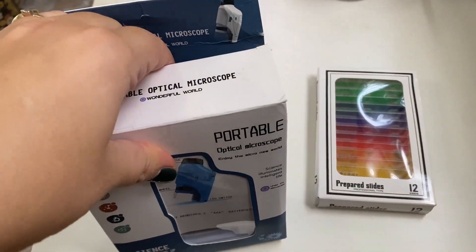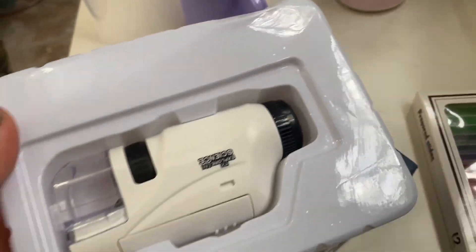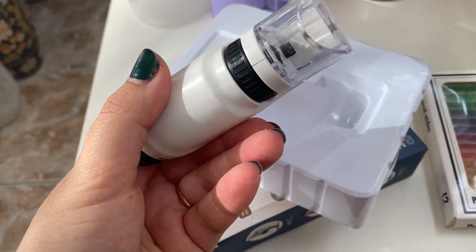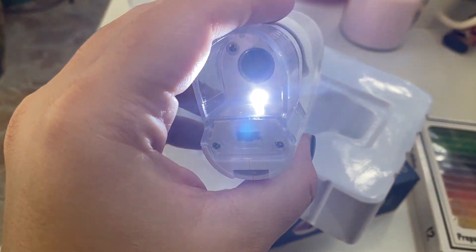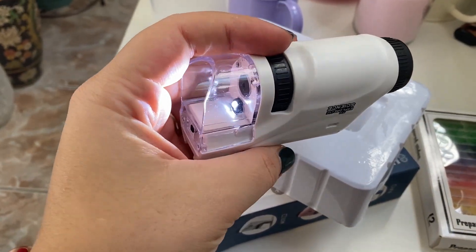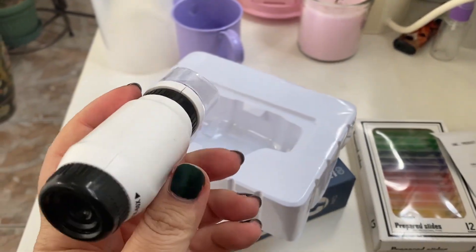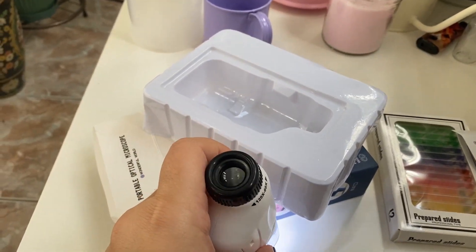Let's see what it looks like inside. So this is the microscope itself — to explore the science. I got it to work somehow; the button is not all the way in the on position, but whatever, it's from AliExpress and it was 15 bucks. The LED is on, and now what I have to do is look through here and point this part to something I want to explore.